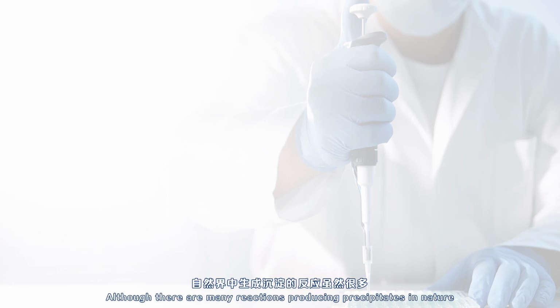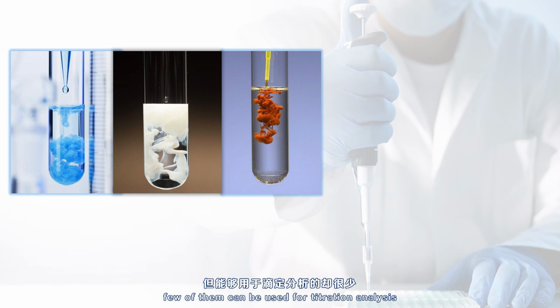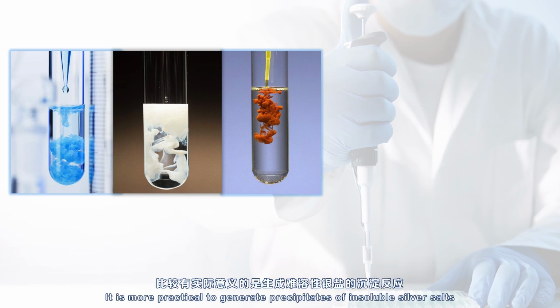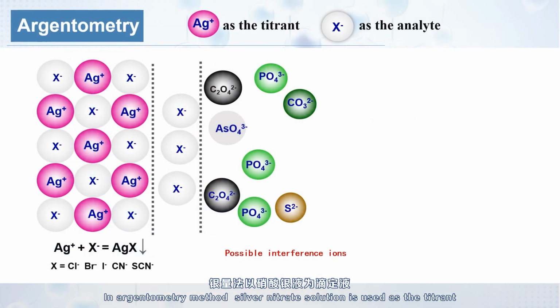Although there are many reactions producing precipitates in nature, few of them can be used for titration analysis. It is more practical to generate precipitates of insoluble silver salts, that is, argentometry. In argentometry, silver nitrate solution is used as a titrant.